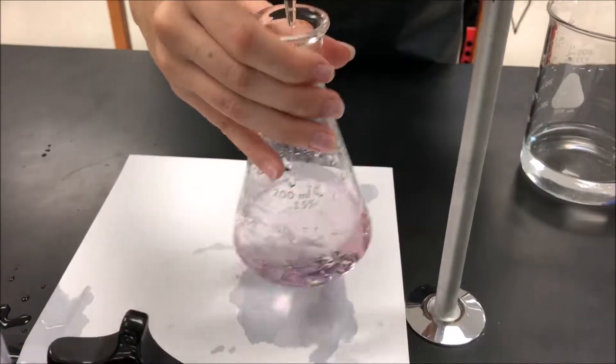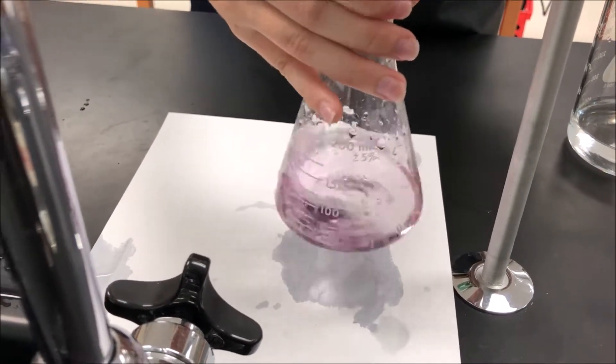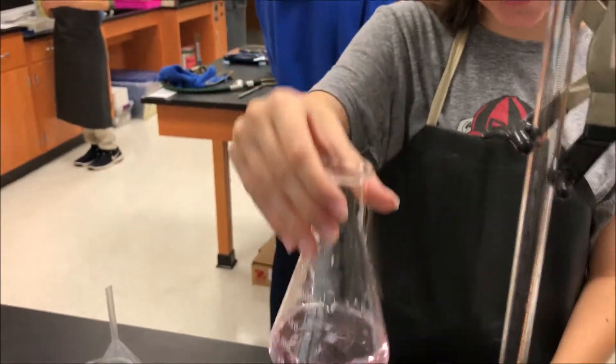It's supposed to turn a mild pink. Keep going — we're using all of it. Okay, we're going to stop here. It changed color. Woohoo! Titration!